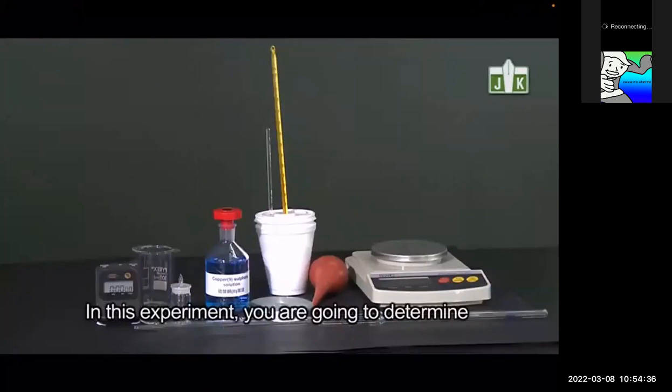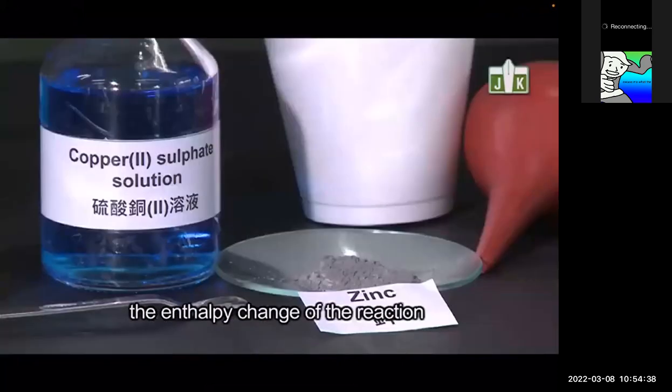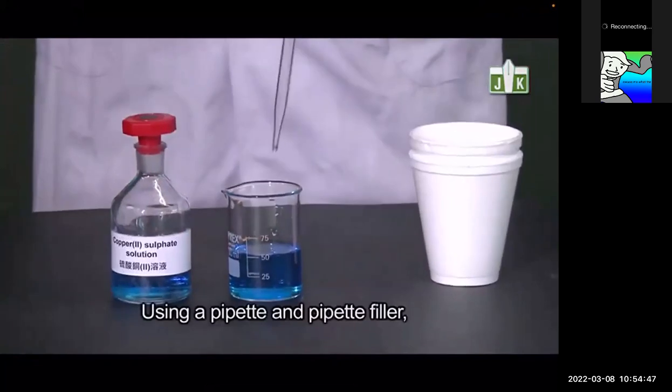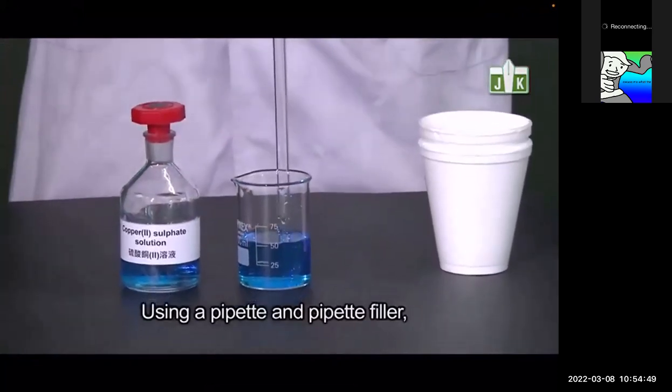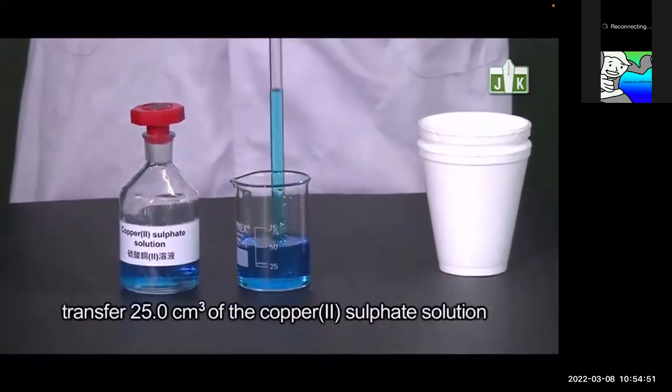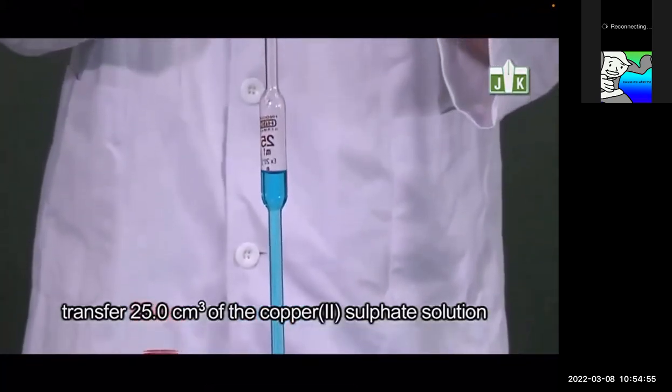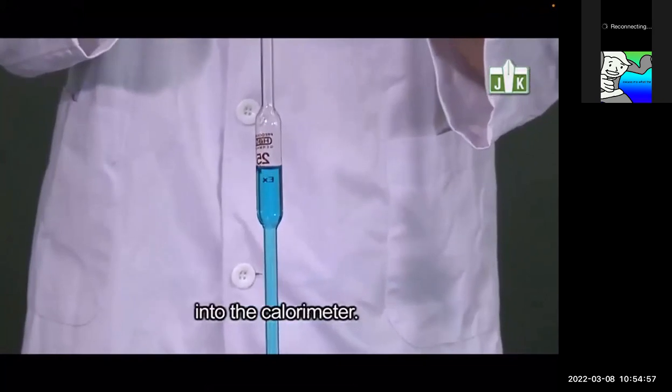In this experiment, you are going to determine the enthalpy change of the reaction between zinc and copper 2 sulfate solution. Using a pipette and a pipette filler, transfer 25.0 cubic centimeters of the copper 2 sulfate solution into the calorimeter.